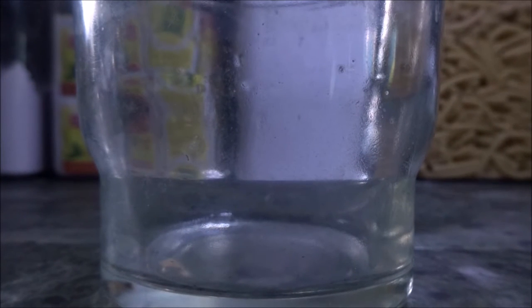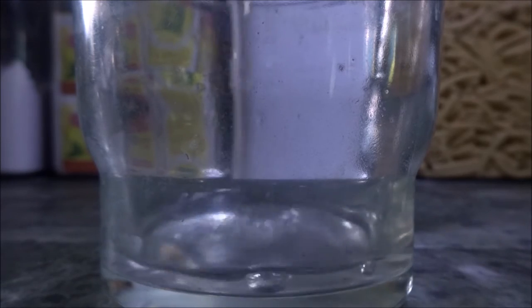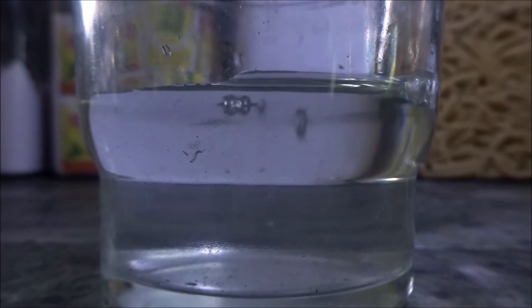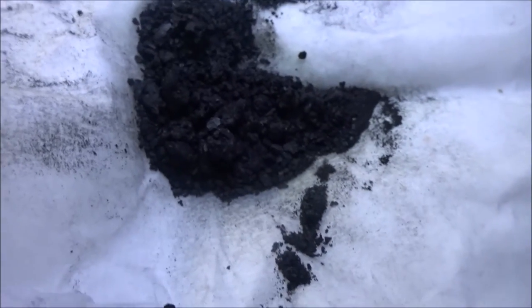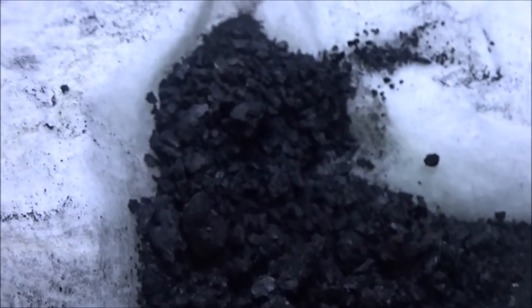After you finish, wash the black solid with vinegar. You're left with a nice black solid.